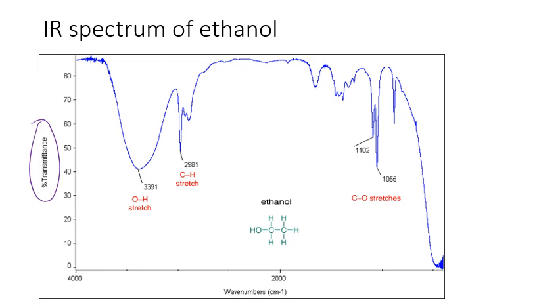A strong peak in the region of 1,055 to 1,100, which corresponds to the fingerprint region of the infrared spectrum, where complex vibrations like the CO stretches are seen. And you've also got the peak range around 2,850 to 3,090 reciprocal centimeters, characteristic of the alkane CH stretches.